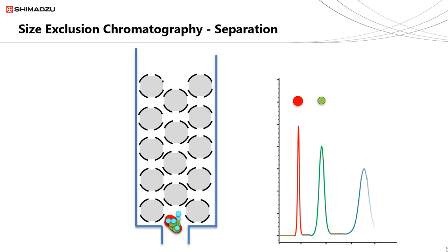As the small particles take the longest, the variation in time is bigger. Therefore, as well as seeing a later eluting peak, they are broader. This is commonly seen within isocratic liquid chromatography separations.